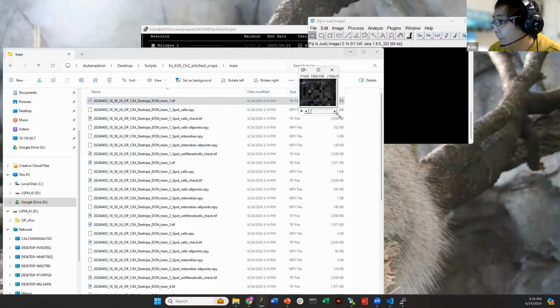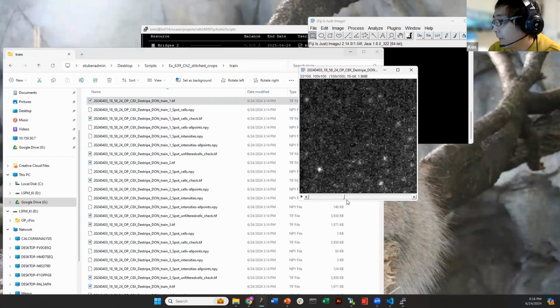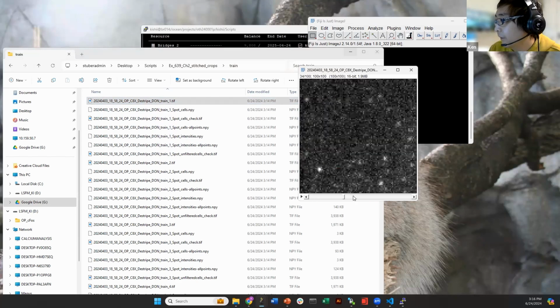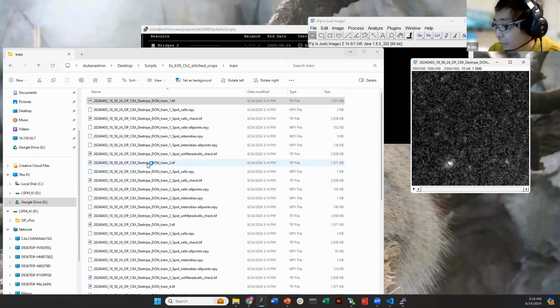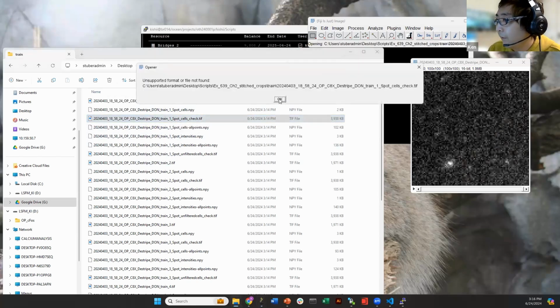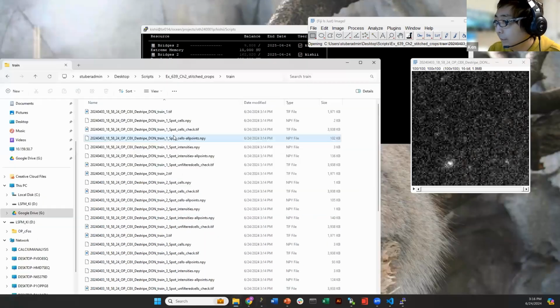If you open the cropped image in ImageJ, it will look like this, and you see an example cFos cropped image here, right? And then the result of the cell segmentation will be stored in multiple files, but mainly this spot cells file here. Sometimes it doesn't load.